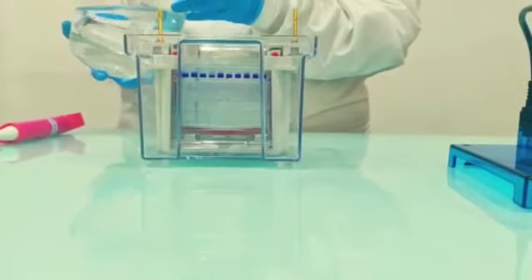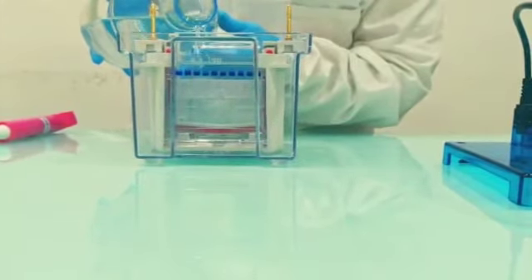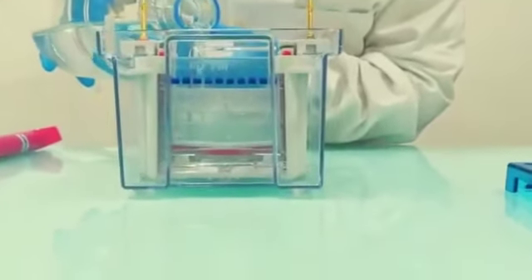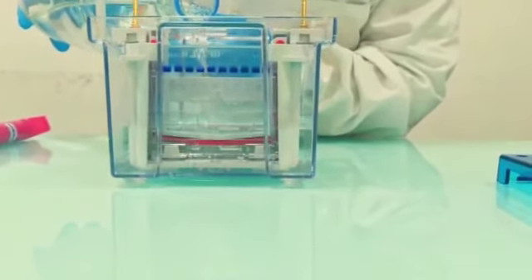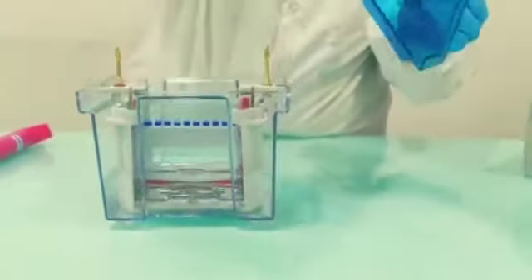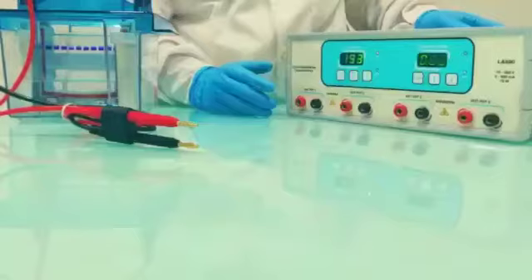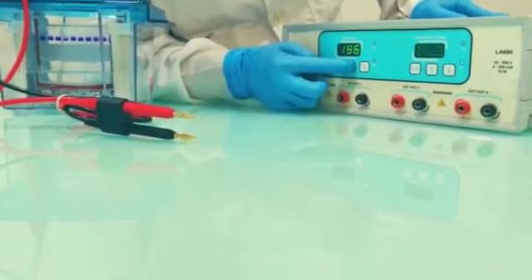Top up the inner chamber with buffer. Fill up the outer chamber just enough to submerge the bottom of the gel. Now we will attach the power supply to the tank. Put on the lid like this. Black to black and red to red. Set the voltage at 200 volts and run for 45 minutes to 1 hour.